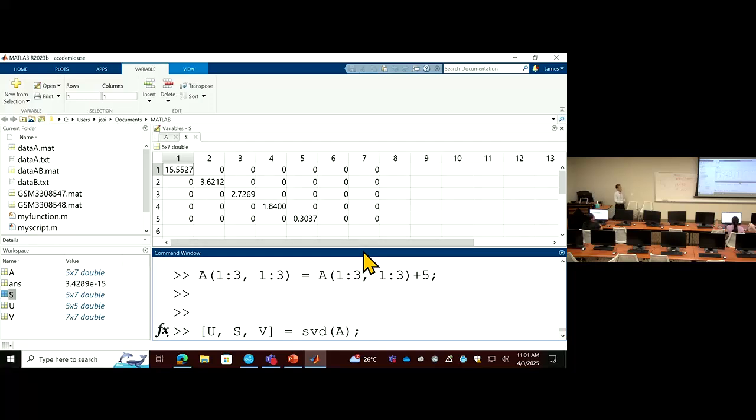You can see the difference in this decomposition and the singular values. The first component becomes 15 compared to the purely random one. This number tells you that from that direction there is some structure you can learn from this manually changed matrix.